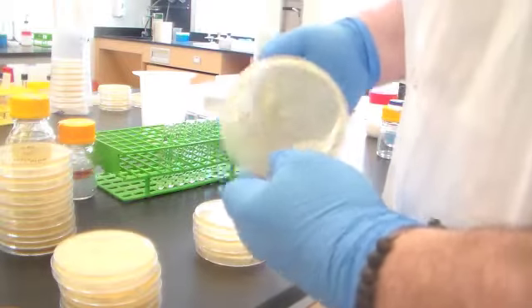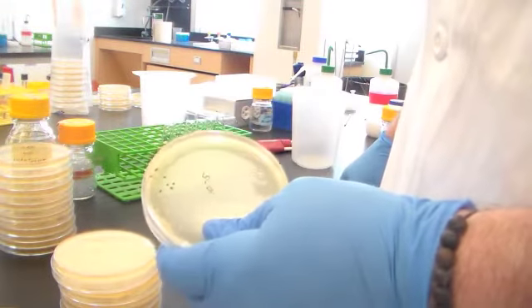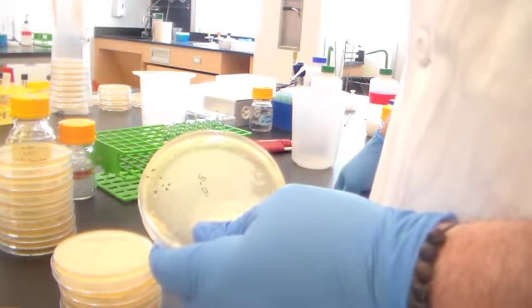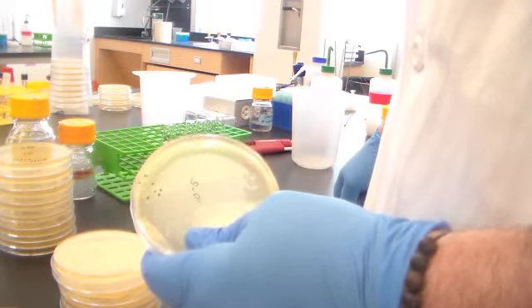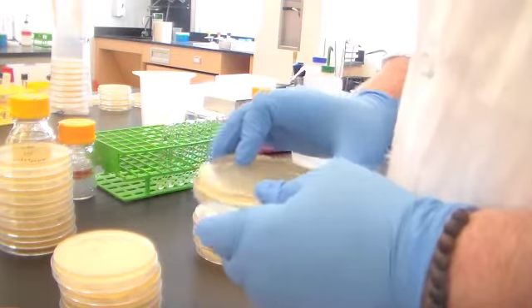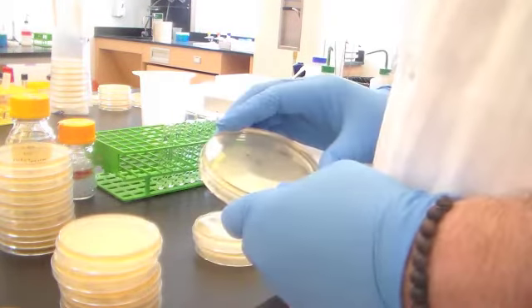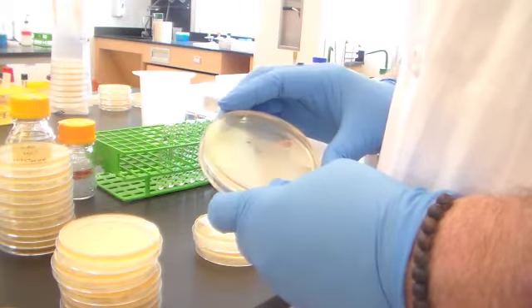Now, you want to look for a plate that has probably no more than 250 colonies, because if there's more than 250, there's a chance that you'll miscount. And you want to have a plate that has no less than 25. Pipetting error could really skew your results.